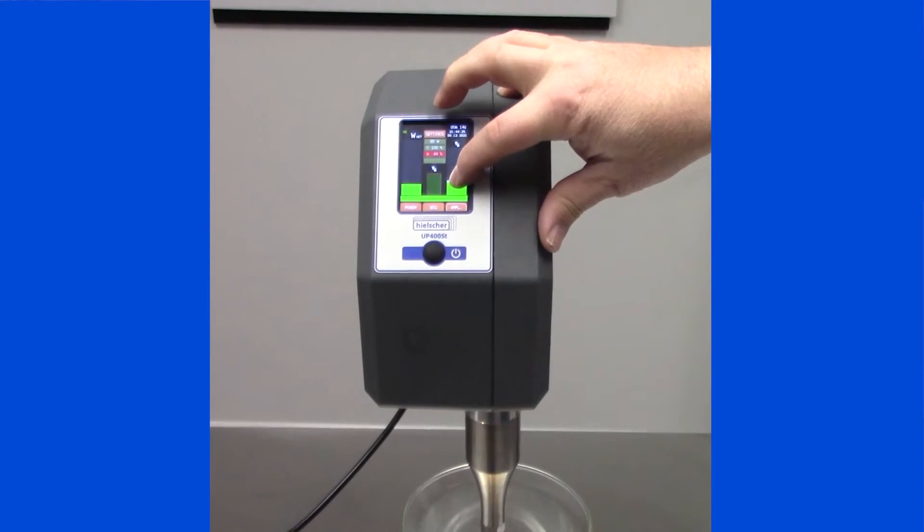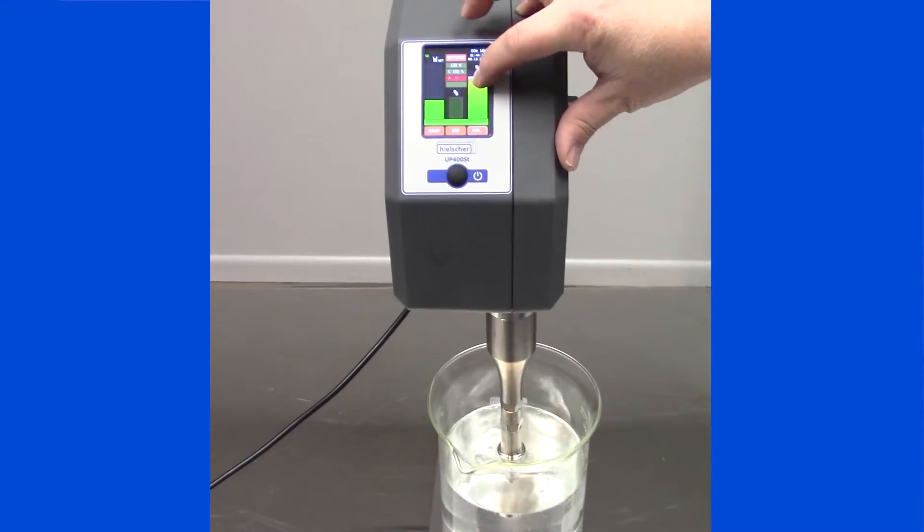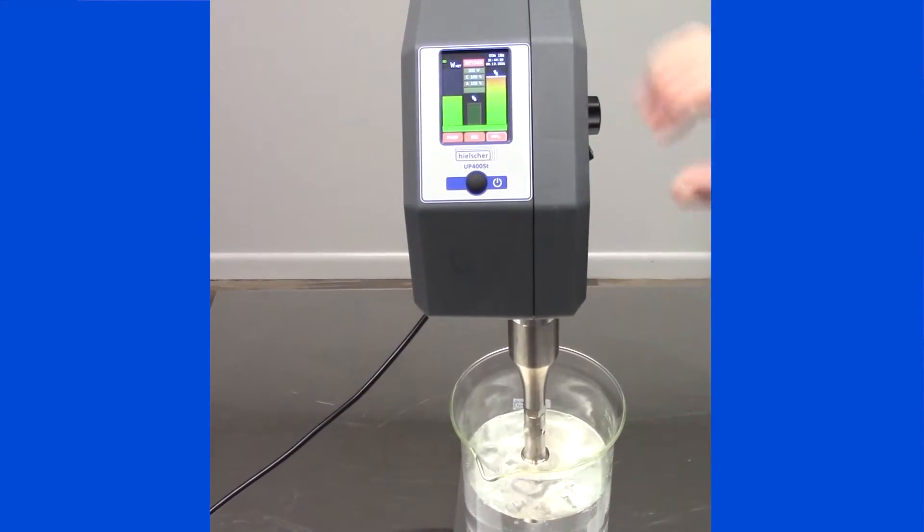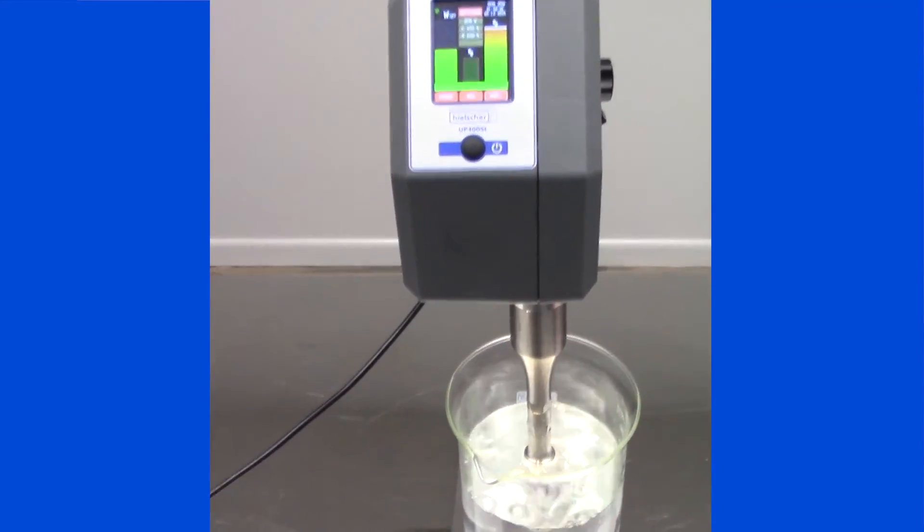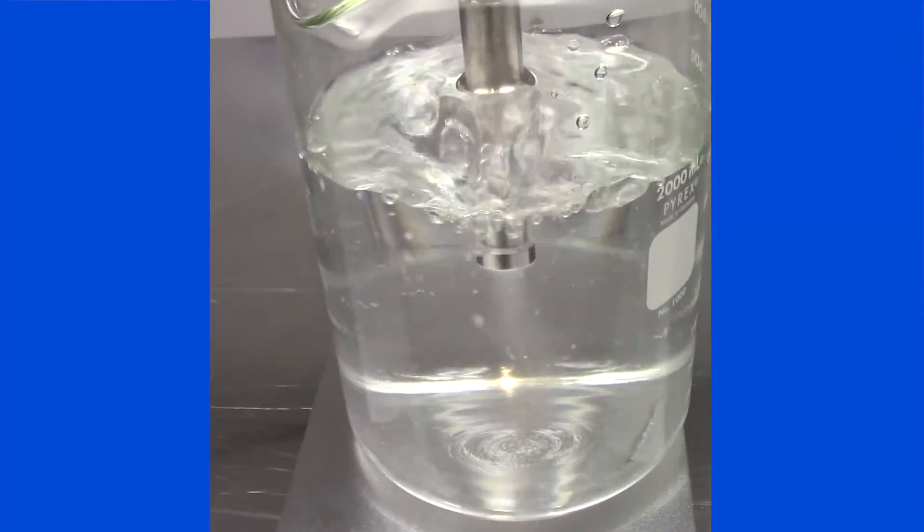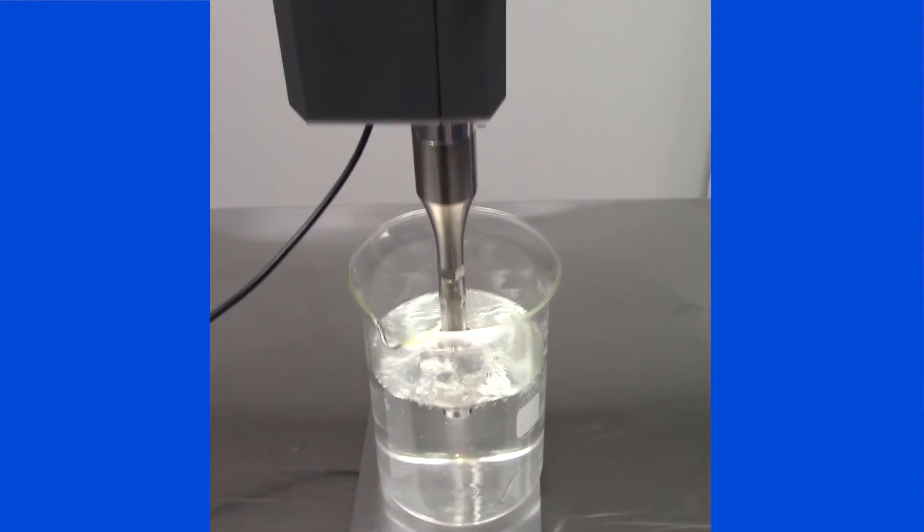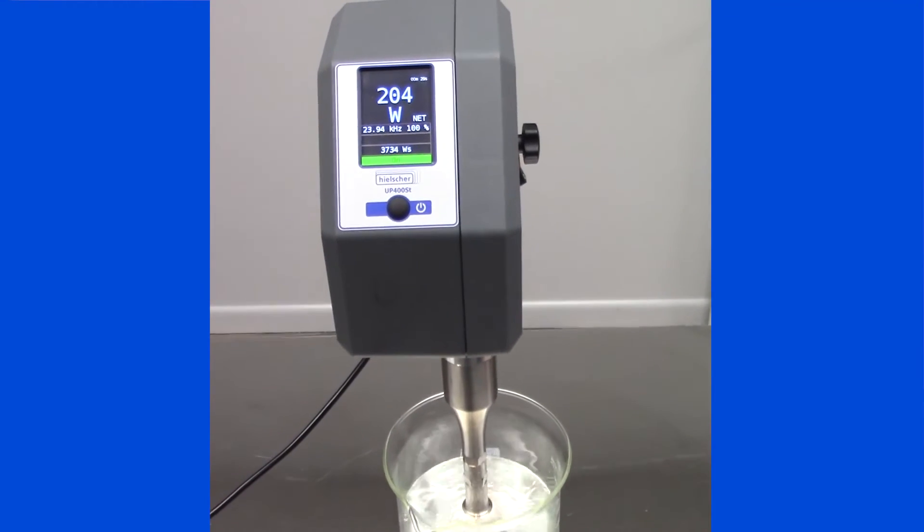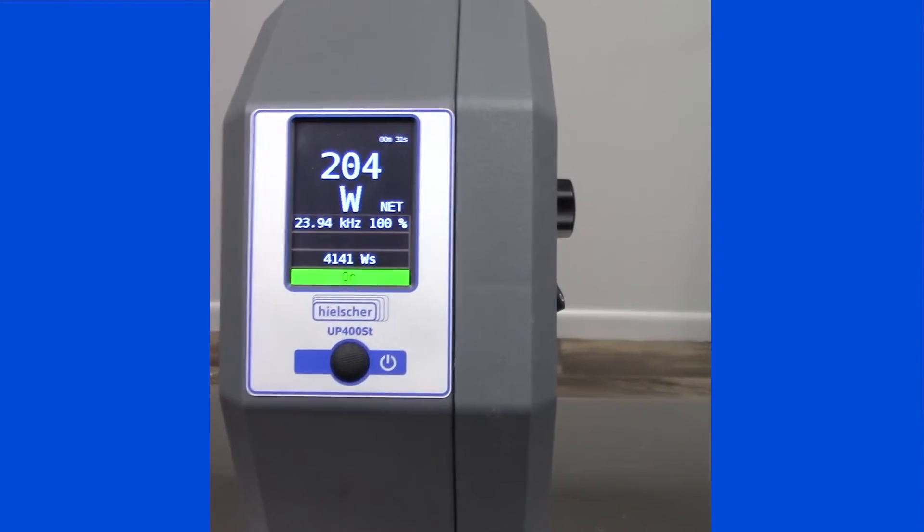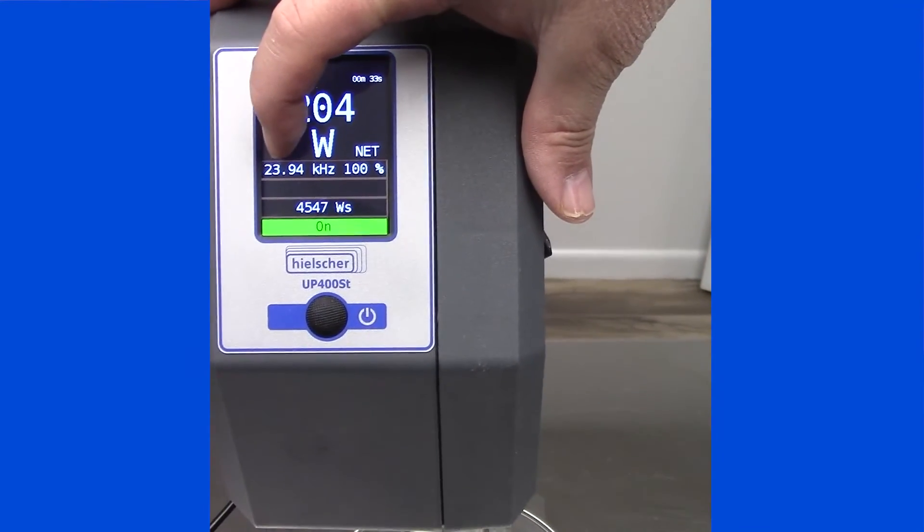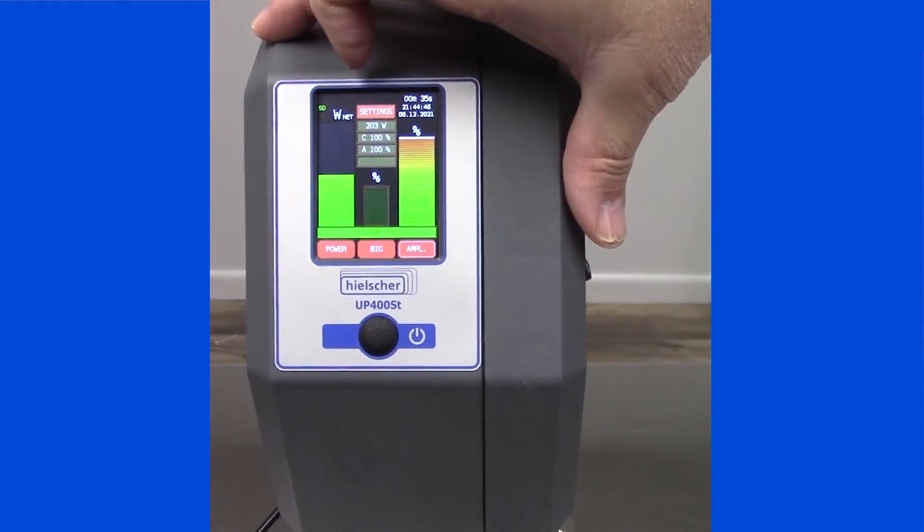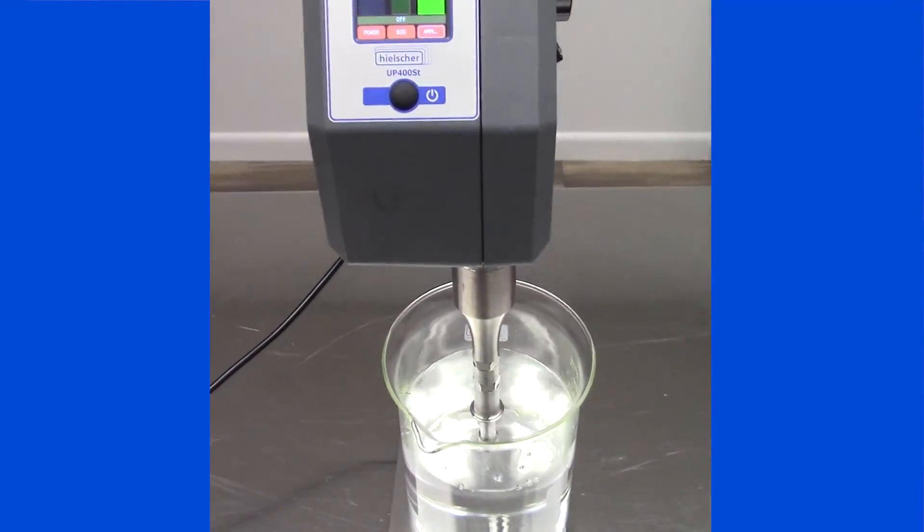Please feel free to contact the Hielscher Sales application team to discuss and get their recommendation on the correct sonotrode to generate the most efficient cavitation field for your application. As an industry leader in ultrasonic technology, Hielscher Ultrasonics has a variety of standard and even custom sonotrodes to meet the most rigorous applications. Thank you once again for viewing this demonstration of the UP400ST.